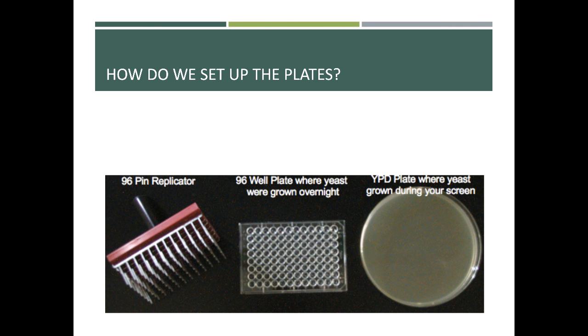So unfortunately, you can't do this with our online lab, and there's not a good simulation for it. But I'd be happy to show you how we do this anytime when we're allowed to get back on campus. But we have this metal tool here that we call the 96-pin replicator. There are stainless steel pins all along here, going from the bottom of the base straight down.